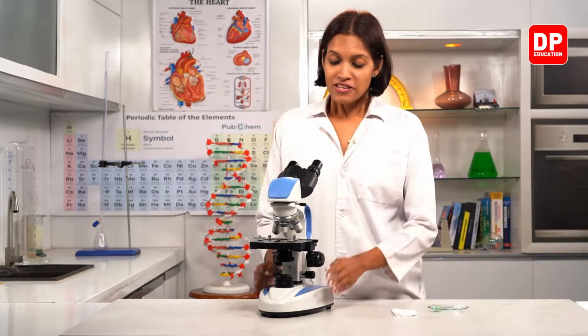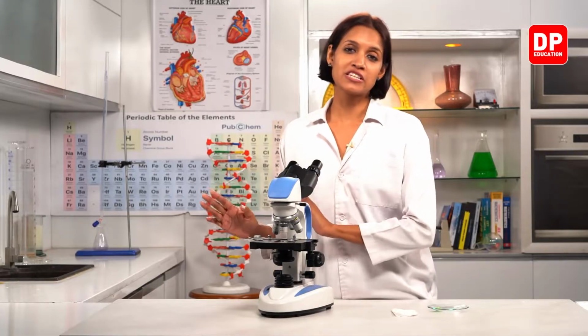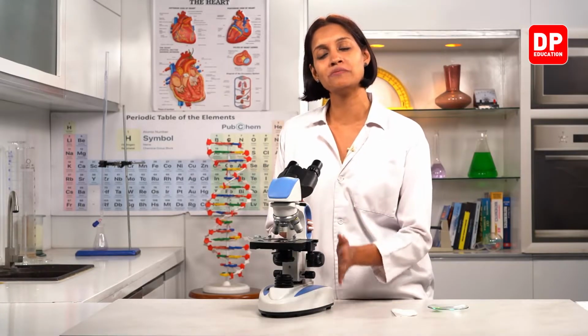Okay, children? So the next thing is, when we store this microscope in a cupboard or anywhere, we always have to place it in an upright position so that it will not collect much dust.